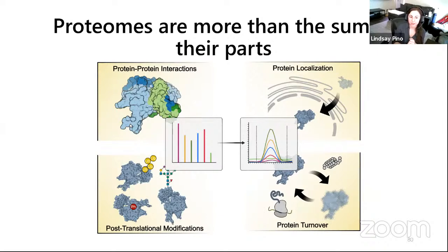I know Spectronaut can do at least single PTMs. DIANN, Diane, can do PTMs. So yeah, definitely you don't have to have a paired spectral library for multiply modified peptides. I think it's just a problem that's a little bit too hard for DIA right now. So right now, I like continuing to do those DDA spectral libraries.